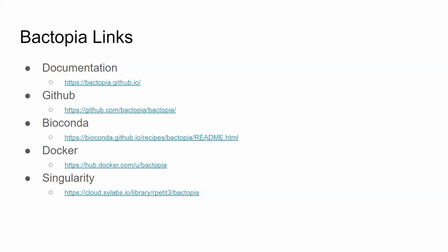Because part of the Bactopia mantra is try to go with public sources, are those obtained through public channels somehow? So yeah, this is where it would be nice if through the data curation step, you analyze a specific bug and you find that these parameters are the better thresholds through this Bactopia datasets curation.